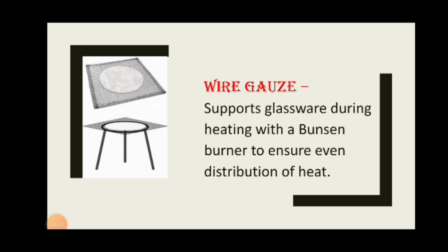Kasi nga, madidistribute dyan sa wire gauze. Ano yan? Parang pinaka-white na circular part. And that is an asbestos, I think. That is an asbestos, and that is carcinogenic. Yes, cancer causing. So other students will try to play with that asbestos. Carcinogenic when you try to inhale the fume of that asbestos. That is cancer causing.